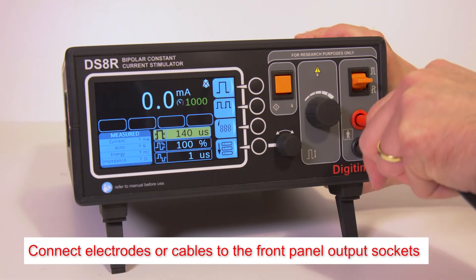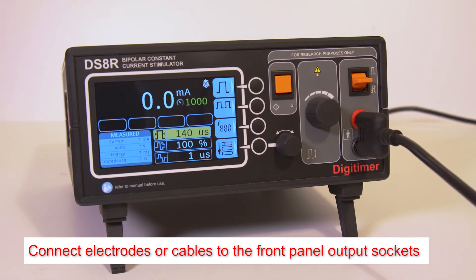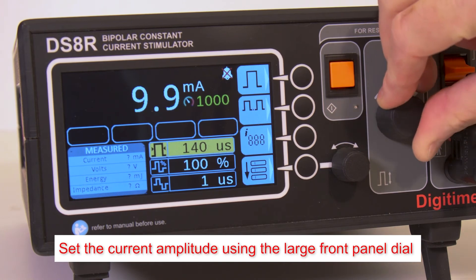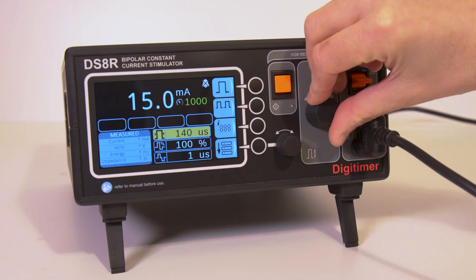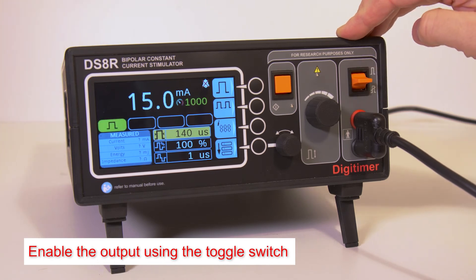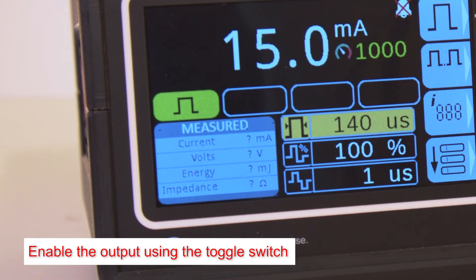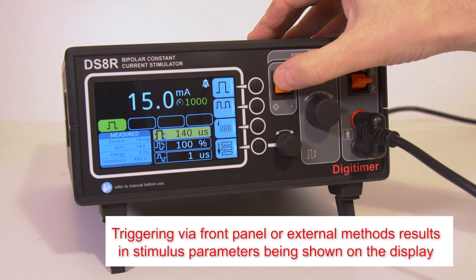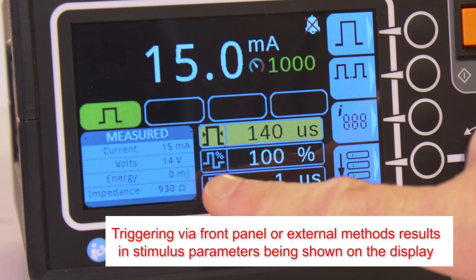Electrodes or output cables should be connected to the 4mm touch proof sockets on the front panel. When in internal control mode, the larger control dial allows for manual adjustment of current. The stimulator output is enabled using an upward deflection of the momentary action toggle switch, and if successful, a green icon is displayed on the front panel. Triggering can commence using the various external methods or manually as shown here. Stimulation parameters are displayed in the measured panel.